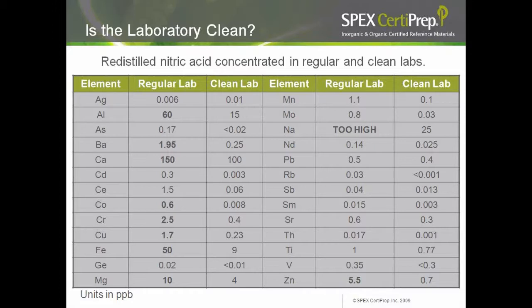Is my laboratory clean? To demonstrate, we concentrated redistilled nitric acid in regular and clean labs and then analyzed it. A regular lab follows GLP protocols, maintains good housekeeping, and is kept spotless — clean in an ordinary sense. However, a clean lab is one constructed with high-quality special materials and special air handling systems. As you can see, contamination from aluminum, calcium, iron, sodium, and zinc from a regular lab is much higher than from a clean lab.